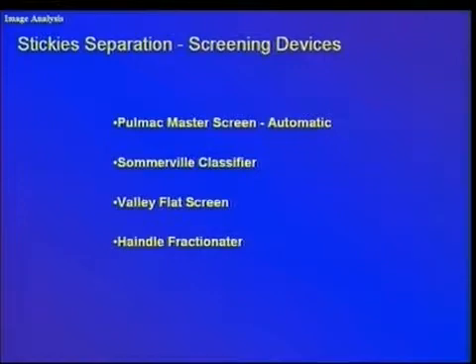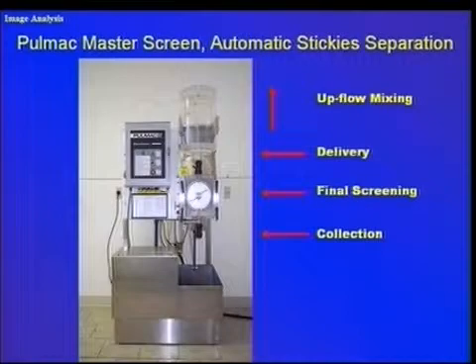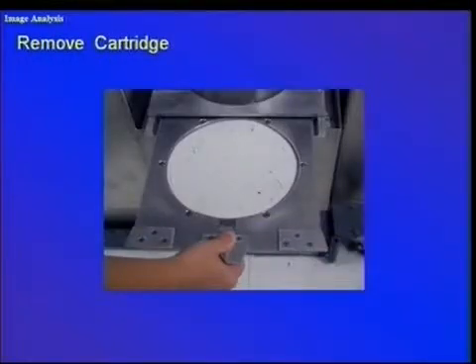This device is different than measuring dirt, obviously. It is an automatic device having several elements, but the output is a filter paper that is nominally 8 inches in diameter, collecting all of the specks or trash that accumulate from a screen that is a 100 micron screen.